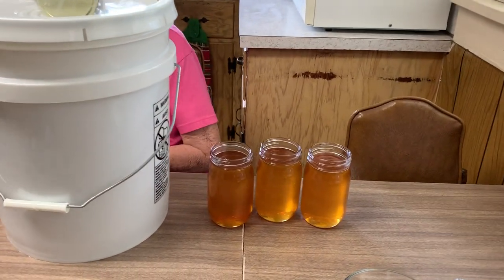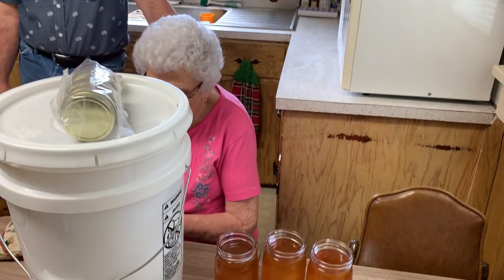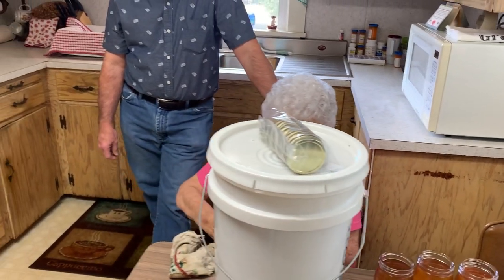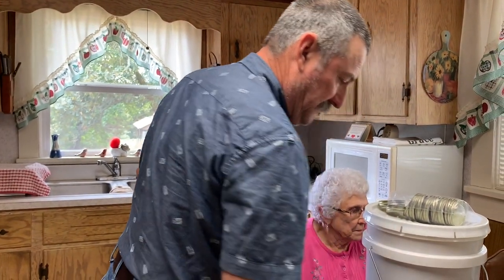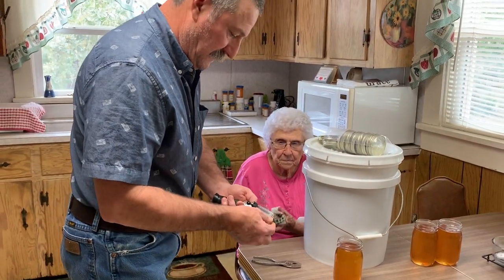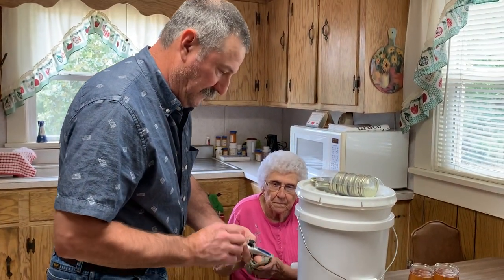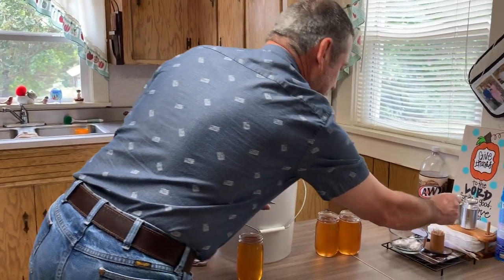I see you've got your system here. You've got your gate where you can lock it. Yeah. And I'm going to slide one of your jars over here, and we'll get a little dollop of it and put it on the refractometer and tell folks a little bit about this. I'm going to borrow one of your toothpicks.